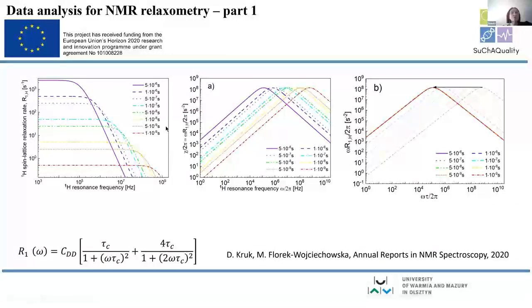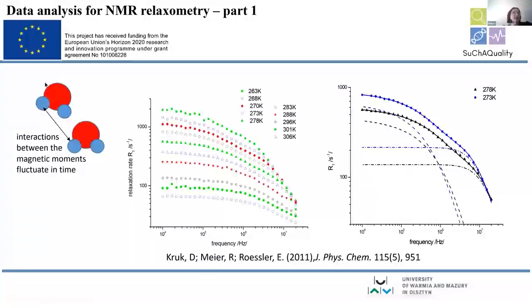Nobody wondered about that at the stage when this theory was provided. It was the first relaxation expression. It was a great achievement. But if you want me to tell you which motion, I would say again, isolated water molecule and rotational dynamics.